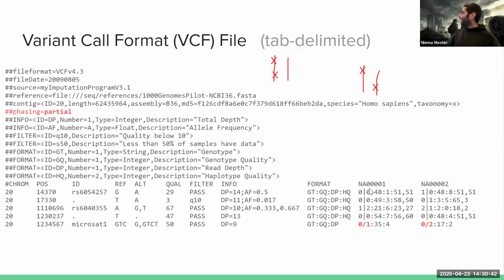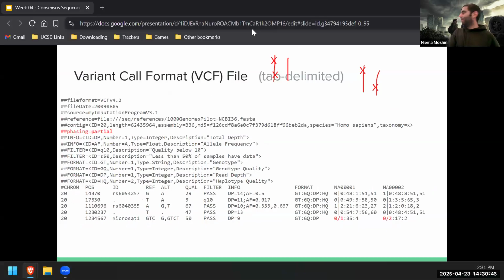Okay, so I think some folks asked if I could do some actual data analysis. So I was going to probably spend the remaining 20 minutes taking a raw sequencing data set, mapping it to the genome, and then doing variant calling. Is there anything else folks want me to do instead or in addition to that? Yeah, go for it.